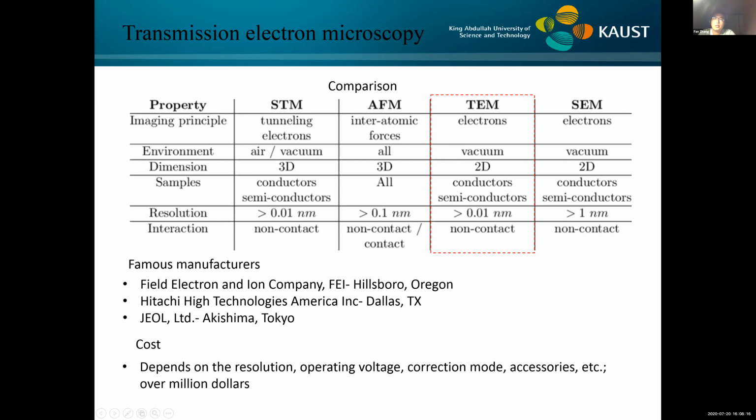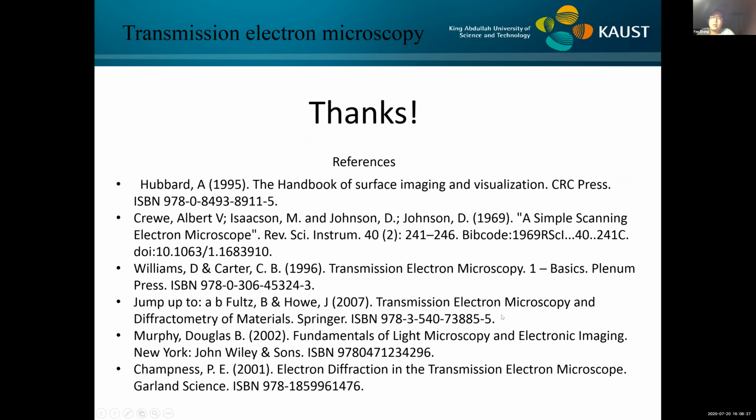The cost of a TEM depends on a lot of things, for example, the resolution, the operating voltage, the correction mode, the accessories, and so on. Most TEM systems are very expensive. They're over $1 million. And that's all about my presentation.